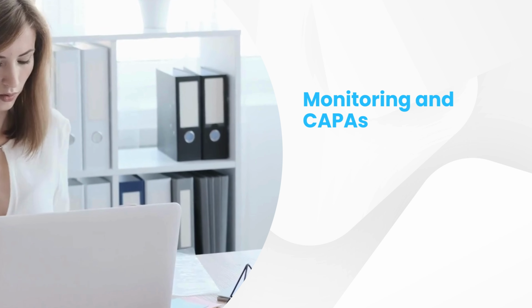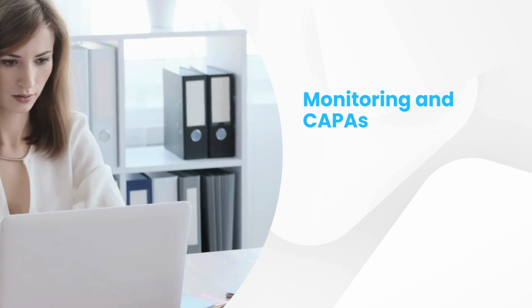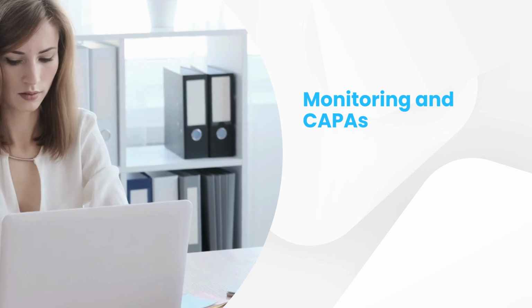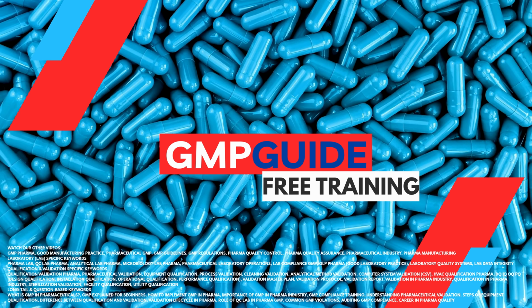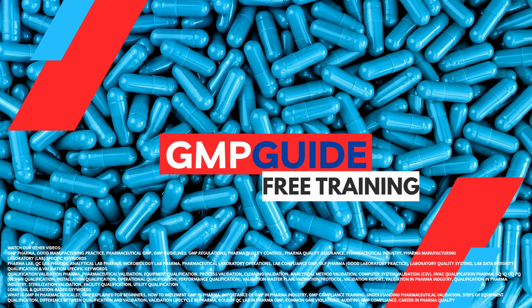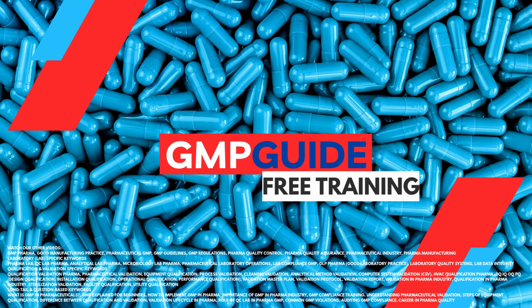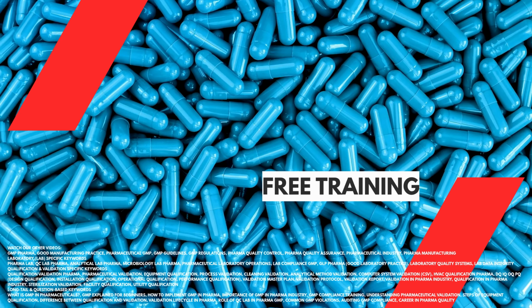Identifying the specific root causes of bacterial contamination in a cleanroom requires thorough investigation, including environmental monitoring, trend analysis, and potentially root cause analysis techniques. Addressing these root causes through improved procedures, training, maintenance, and design is crucial for maintaining the integrity of the cleanroom environment.